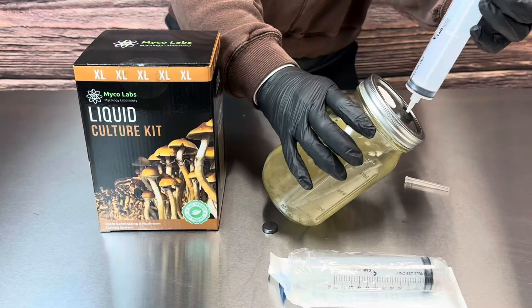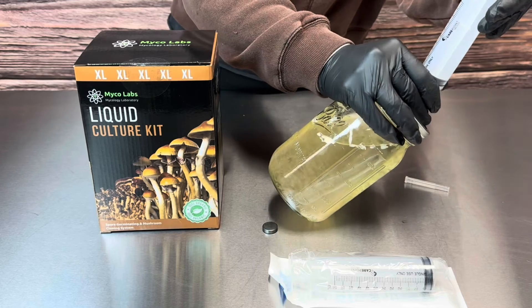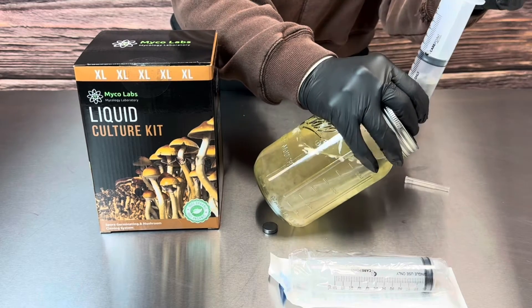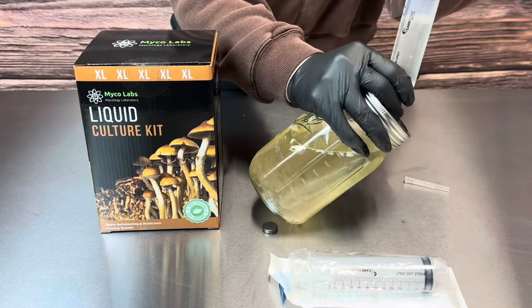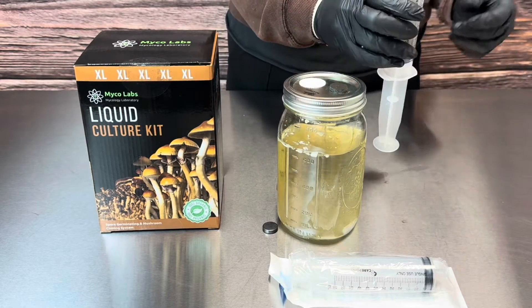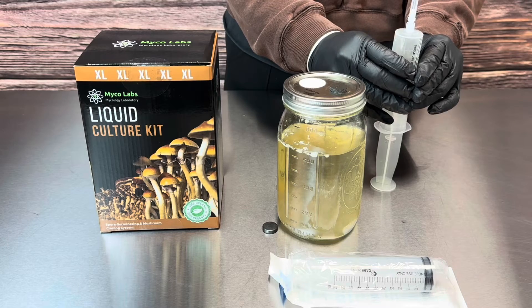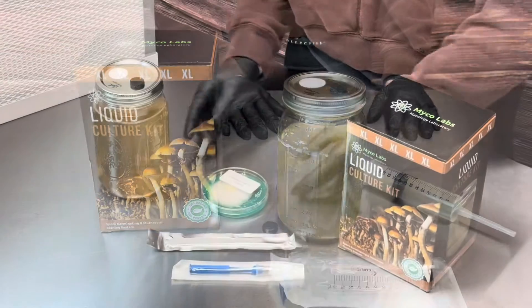When drawing up the 60 cc syringe, you will have to have your liquid culture jar tilted towards the side. If you do get a little air in your syringe, it's okay — just tip it upside down with the needle pointing up and slowly press out some of that air.